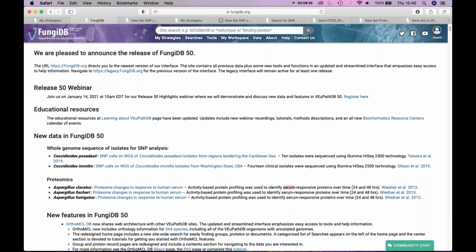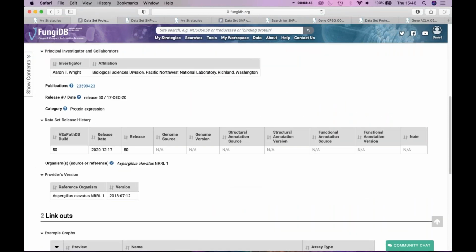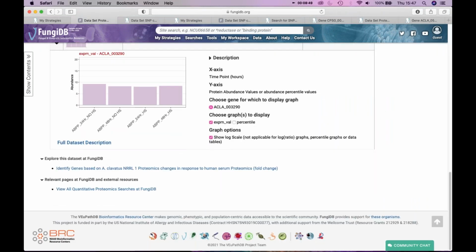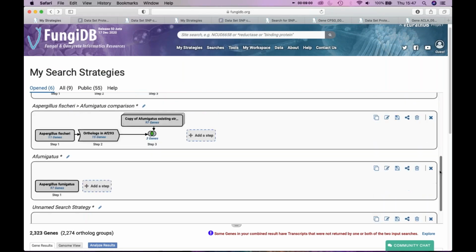To run a search, for example, you can also navigate to individual gene record pages or deploy a search from the top, just as Suzanne has shown you before, and view the type of data that is available for this type of data set. I have pre-run these searches, and I just want to quickly demonstrate the results of the analysis that I have.